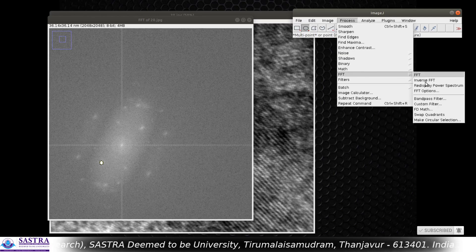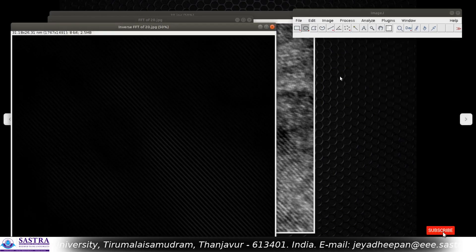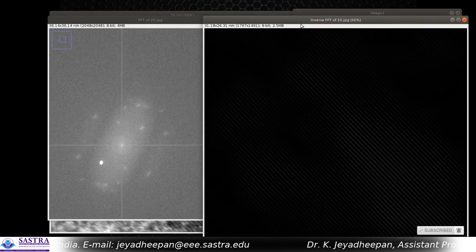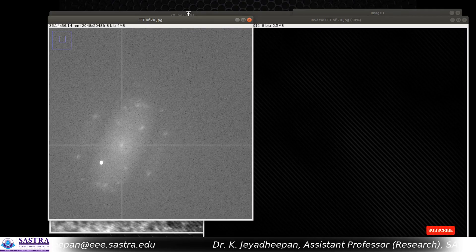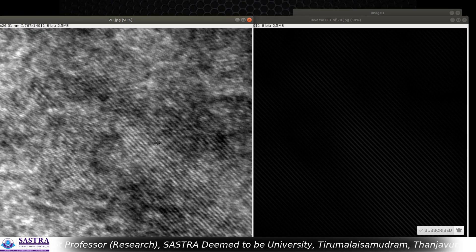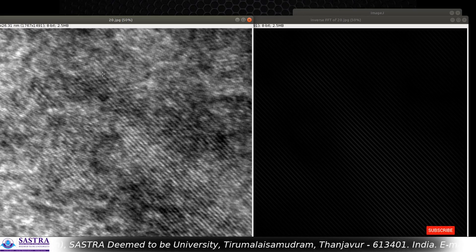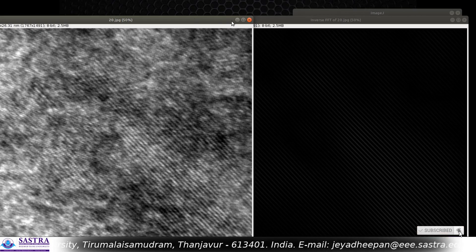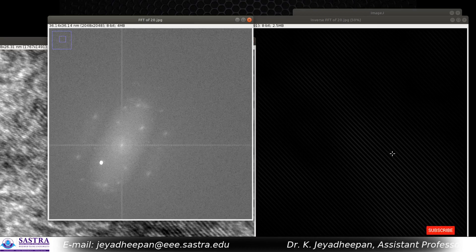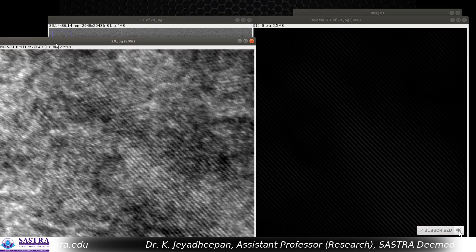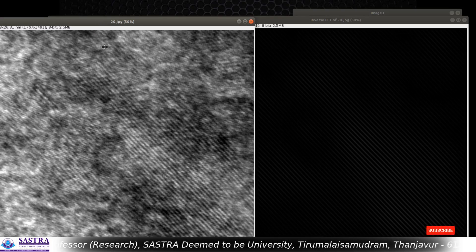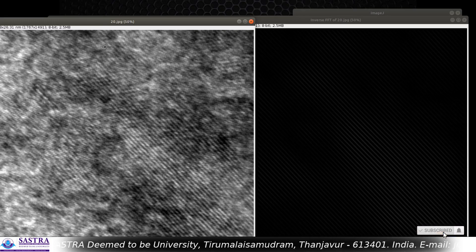Now go to Process again, go to FFT, and do Inverse FFT. Now you can see the lattice fringes, which are somewhat analogous to the original. The lattice fringes are in the same angle in both images. If you select any other spots in the FFT, the lattice fringes will not be in this angle. So you have to select the spot whose intensity is highest compared to all other spots.